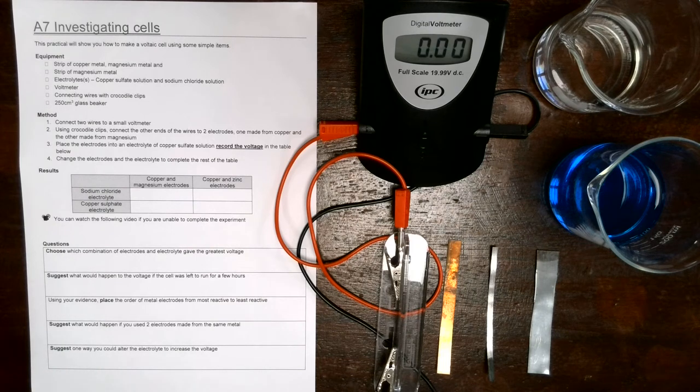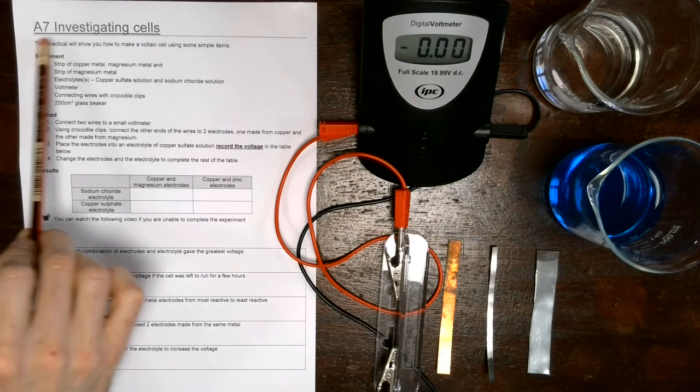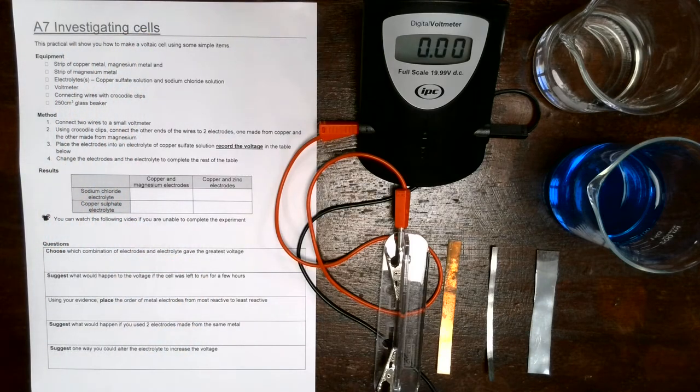So in this video we'll be on C5 topic Appendix 7, investigating cells. In this investigation we're going to be constructing four different cells using different metals and electrolytes, and we're going to be recording the voltage that is produced in each one.